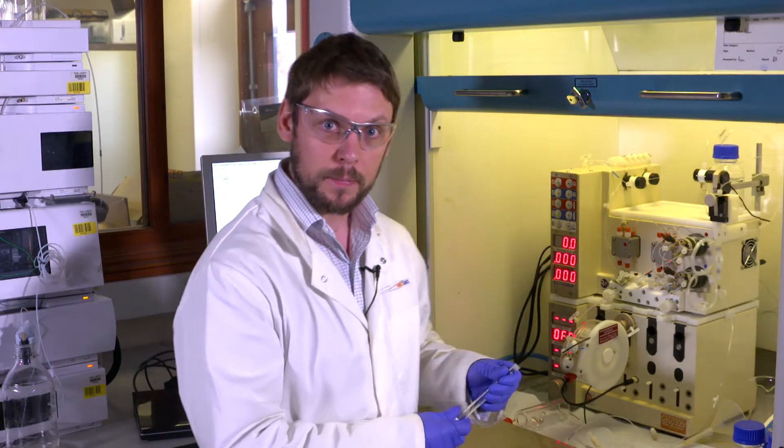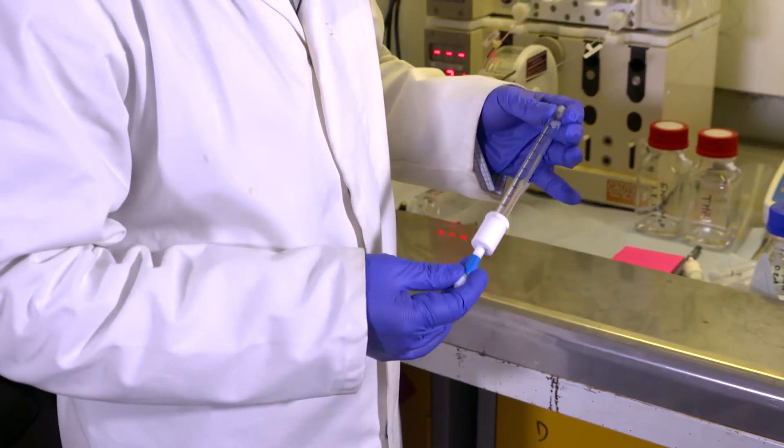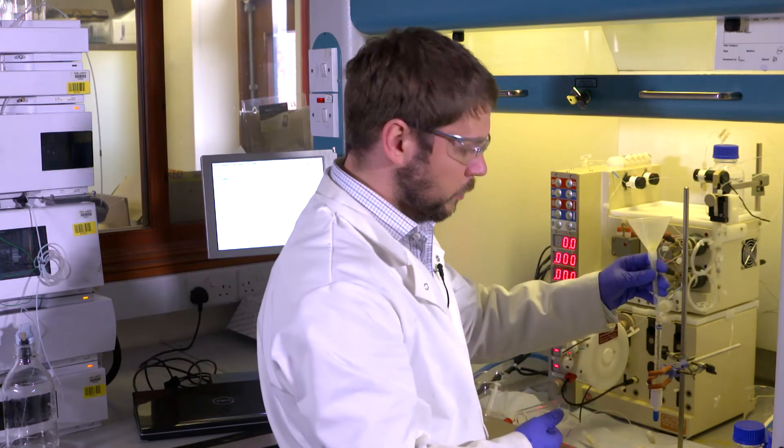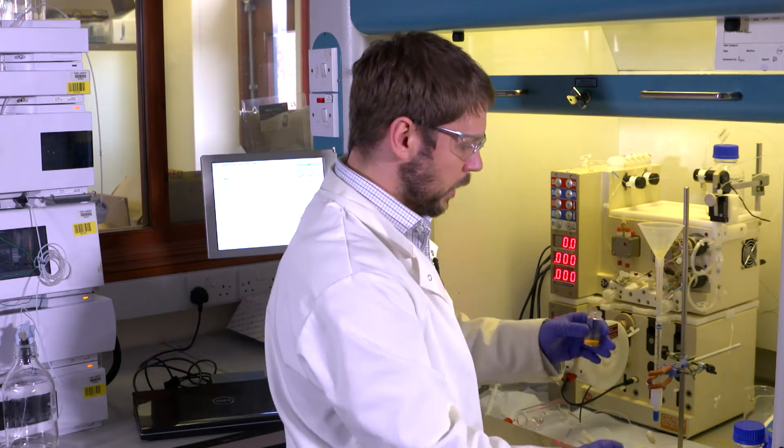This is what we need to do to get it ready. The first thing to do is to put the catalyst in the column. I'm going to weigh the column first so I know how much catalyst I'm using. Using a funnel I can add the amount of catalyst that I want to use — this is a commercially available supported palladium catalyst.